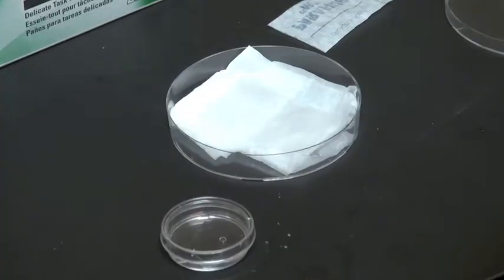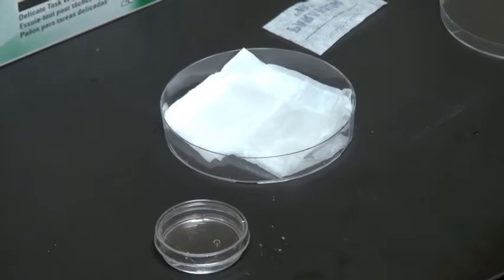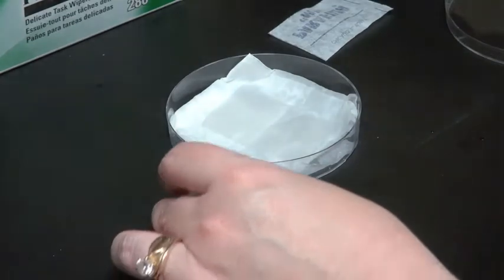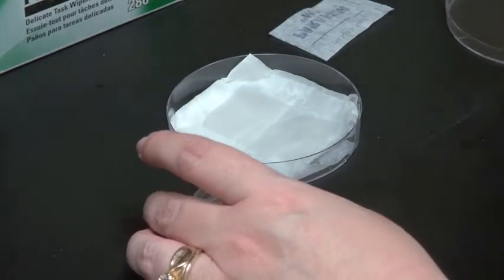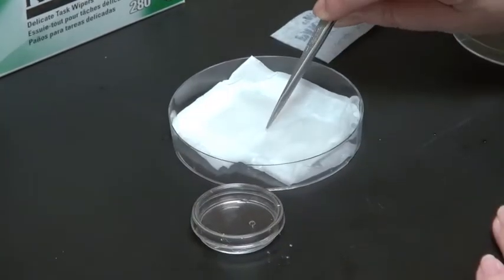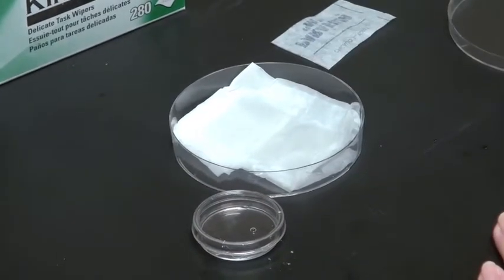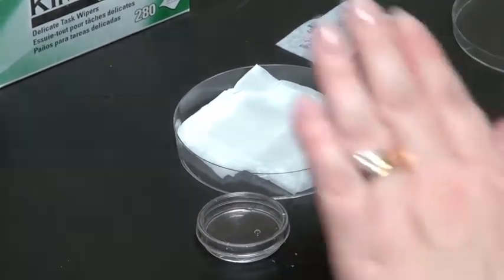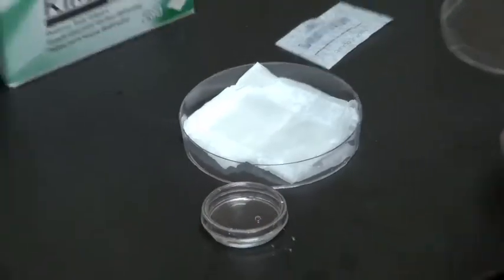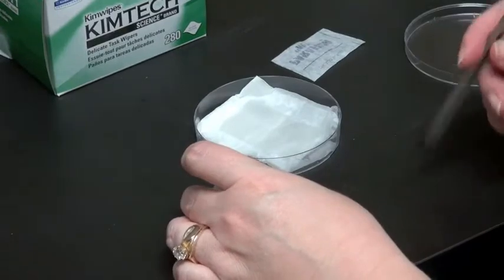The next step you can do either in an inverted way or an upright way. I'm going to do it upright just for ease of showing you, but if you prefer, you can put your drop of reagent on the parafilm and invert your slide — your cover slip — so that your cells are touching the antibody or reagent.